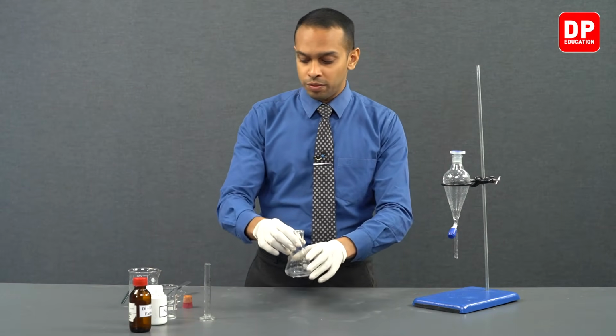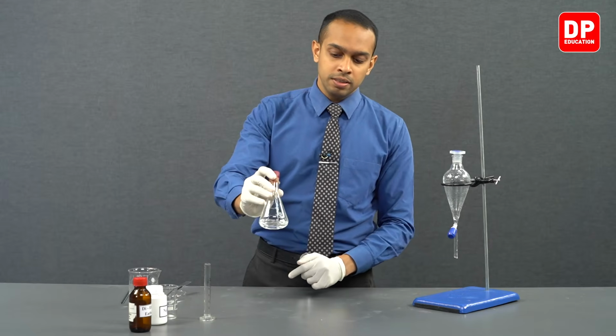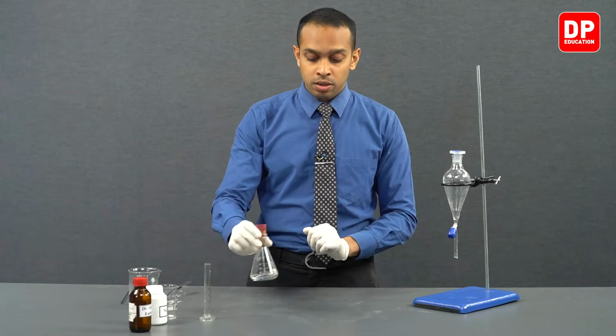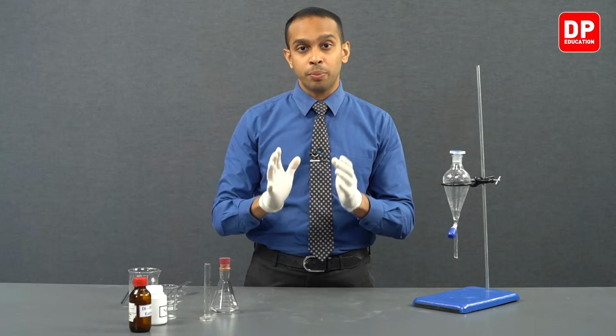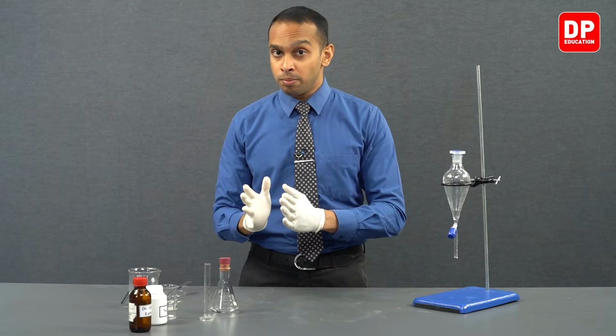Now students, what we have over here is our diethyl ether mixed with our essential oil. There might be traces of water here as well. When we are separating the diethyl ether layer from the water layer, we might have taken a small amount of water along with the diethyl ether layer.